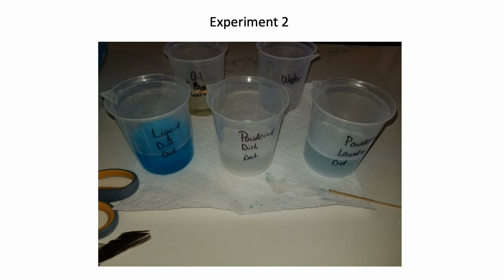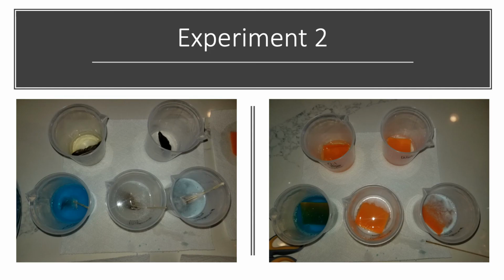In other words, each of these 5 groups is going to get a piece of chamois that incubates for 3 minutes in the beaker, and then we take it out and place it on a paper towel that's labeled with the name of that treatment group. Once we've done that, we go through the same process, but this time using a feather in each of the 5 treatment groups. And ultimately, as you see here, we have a chamois in each treatment group and a feather in each treatment group.